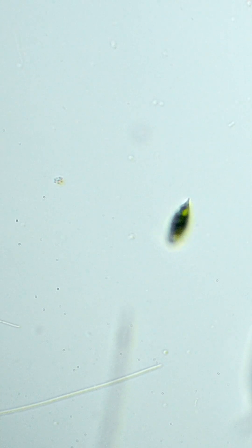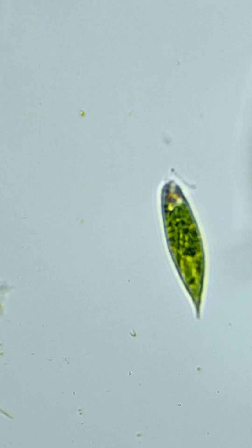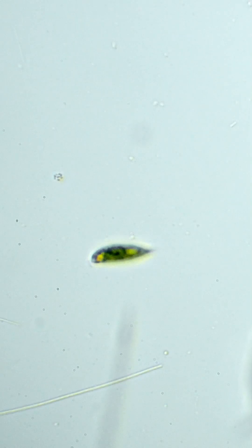There is a fascinating tiny form of life. It's green all over, it moves and it can even sense light. This is Euglena.